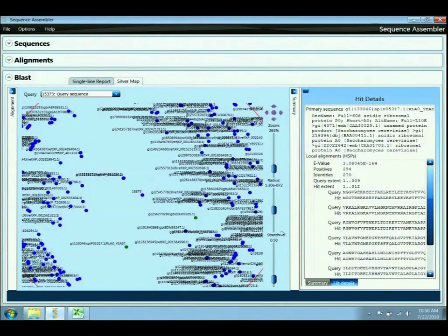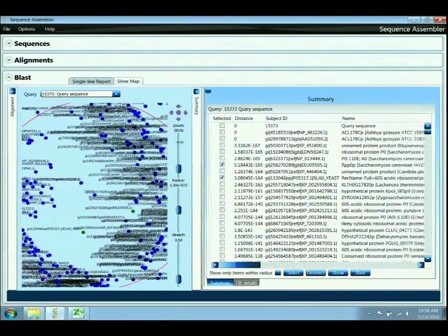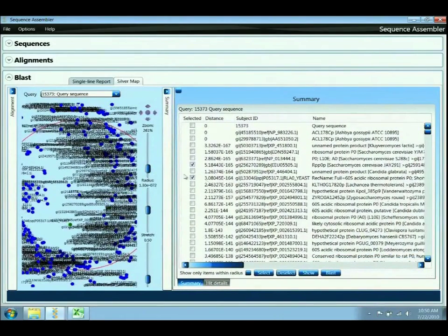Again, I can go back to the summary. I can zoom, pan, decrease the size of either window, and perform all sorts of interesting research on DNA, RNA, or protein sequences. Thanks for taking the time to check out this video.